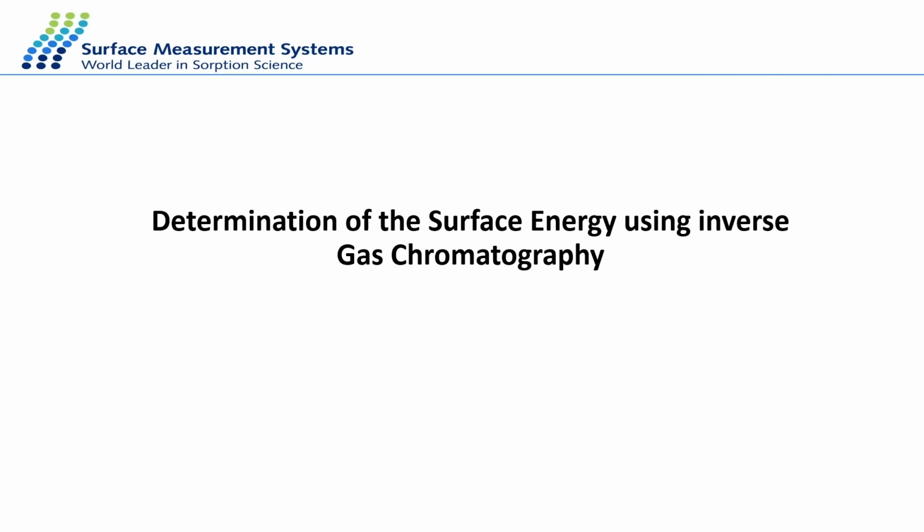It's not always a decreasing trend or an increasing trend. It depends really on the sample, how it will behave under humid conditions. So the next part of my presentation is the determination of surface energy using the IGC technique.